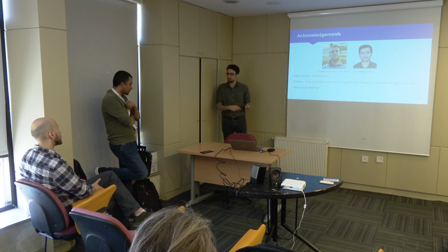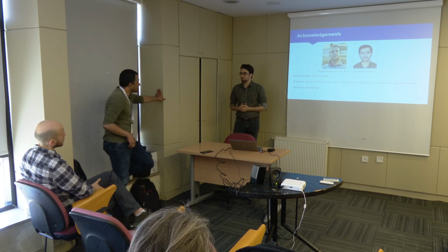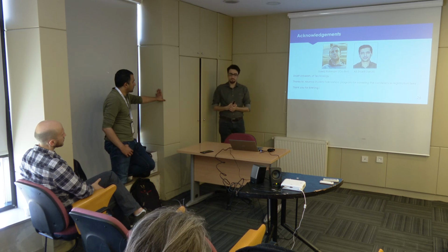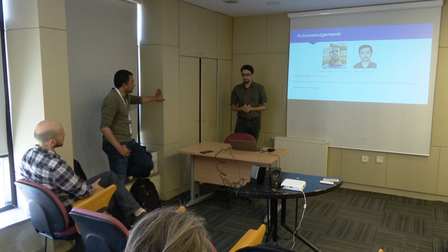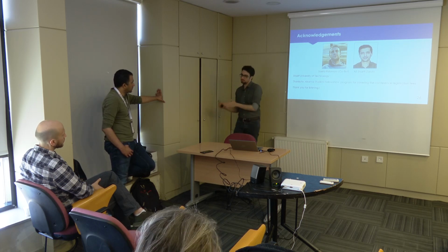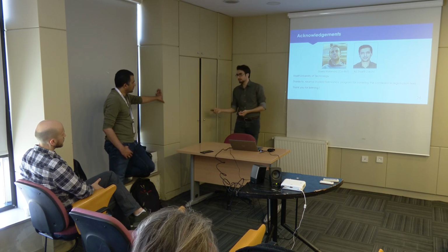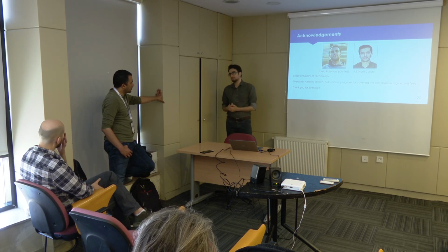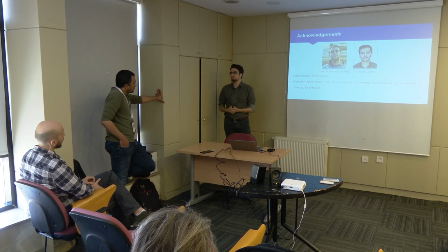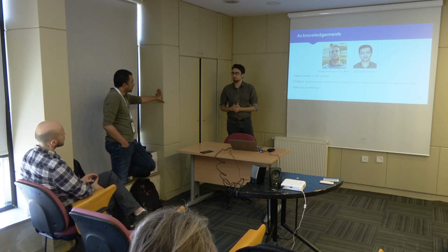We actually tried using this method in RNA-seq to also find the best combinations, mostly for generalization. So we pick the weights from the RNA-seq to another qPCR, not in your case, but in your case it will be just back to another RNA-seq data set. I guess it's worth trying on RNA sequencing and other expression technologies.